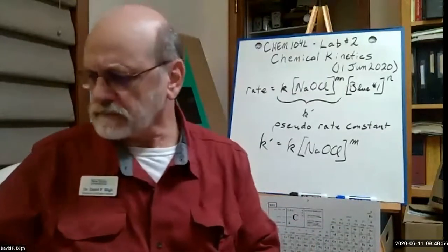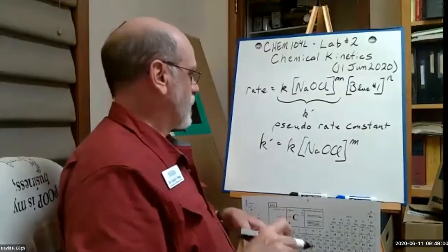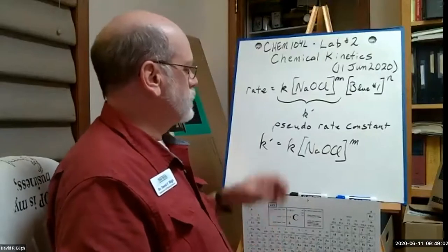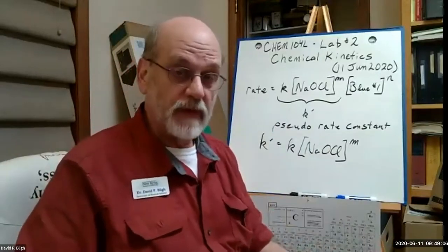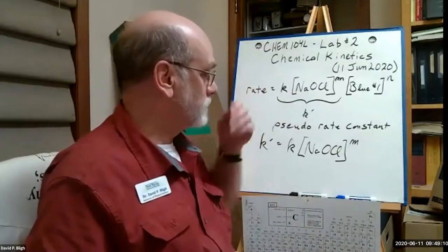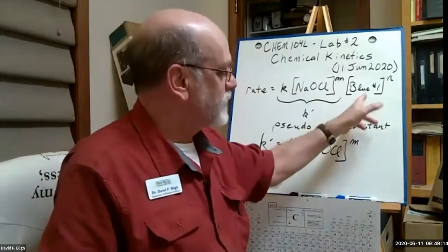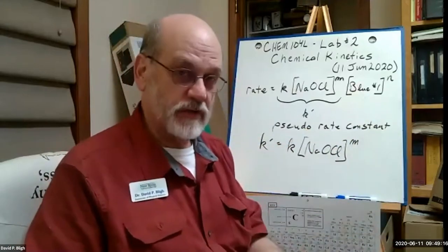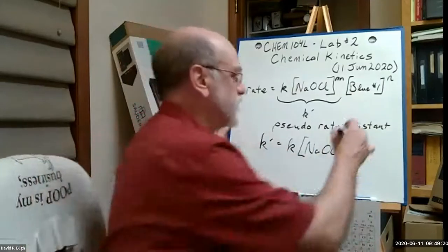Okay. So when we run the experiment through, we do it once at full strength at one concentration, and we get data. Now we're going to use, for this, rather than concentration, an equivalent to concentration, which is absorbance.